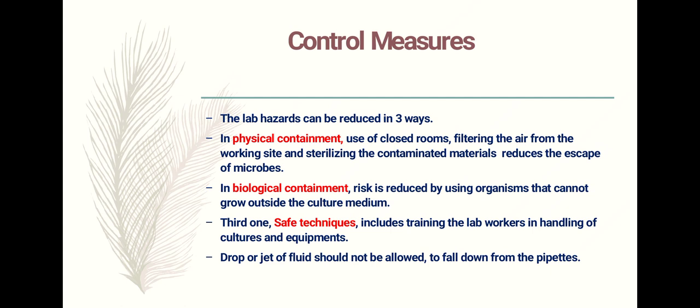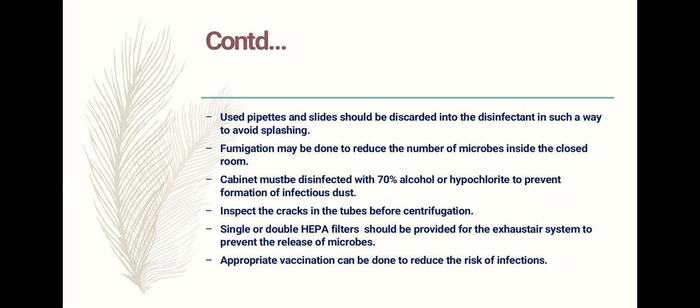Third one, by using the safe techniques including training of lab workers. We have to train them so they can do the work very carefully, especially handling of cultures as well as handling of equipment for analytical purposes. And also the drop or jet of fluid should not be allowed to fall down from the pipettes. So this is an important one that can be prevented. Used pipettes and slides should be discarded only in the disinfectant. Then fumigation of the rooms has to be strictly followed.